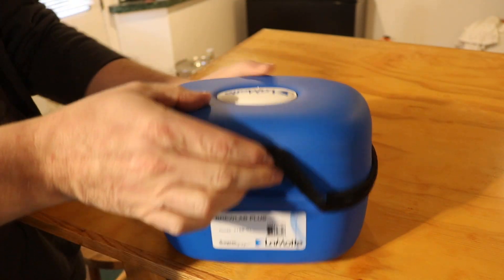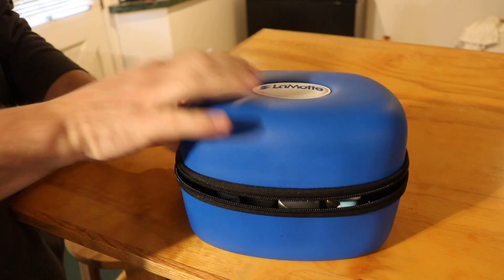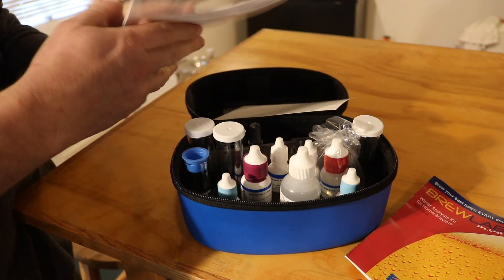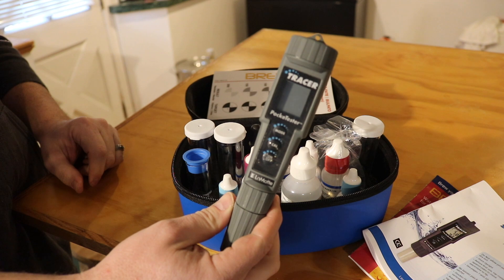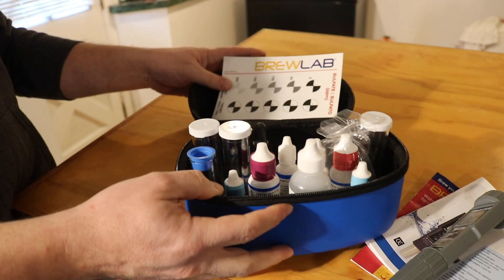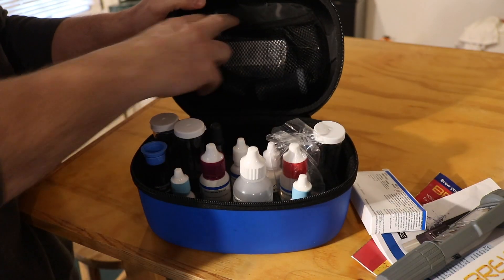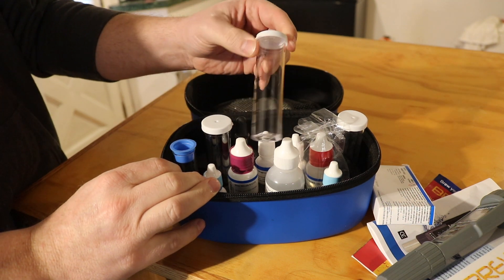Here's the LaMotte brew kit. It comes in a cool soft semi-rigid blue carrying case with a handle on the back. It zips open and inside you find the instructions for all the assays, plus the instruction booklet for the pH meter, which is considerably thicker. There's the pH meter — just a single probe — and then all the little reagent dropper bottles. There are blister packs of other chemicals in the lid, and the kit comes with its own sample tubes for doing the tests.